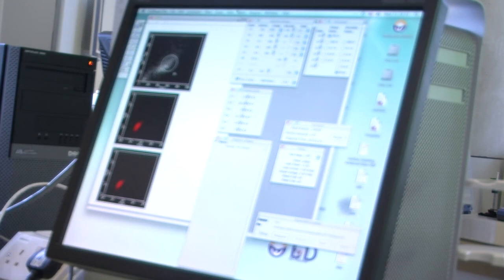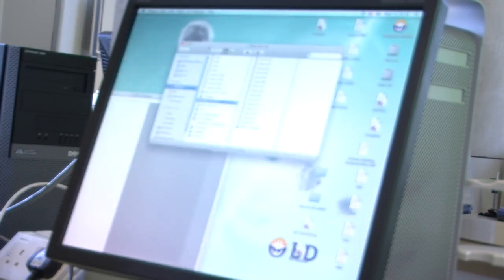We will put all the data available, so if you want, you can compare the data of the repeats for the report. We've got 15 data files. I will take those away, I'll process them all, I'll turn them into plots and charts and histograms and stats. I will send them back, and once they're perfect, then they can be sent out to everyone for you to analyse. And I'll send a handout as well.